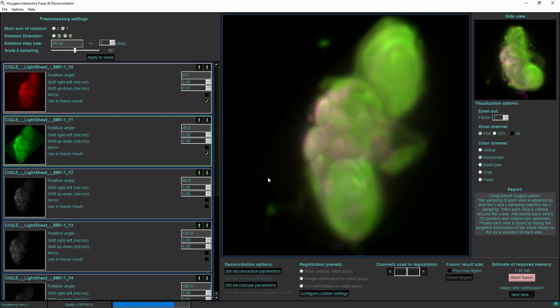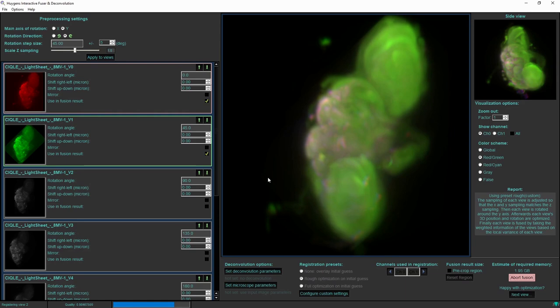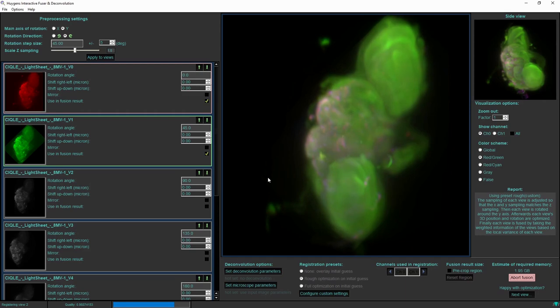So the end result would be the same as it would have been if I had given it a correct initial estimate of the shift at an accuracy of one to a couple of pixels. But now it has automatically found this relatively large shift that was present between the red and the green images in the initial view.